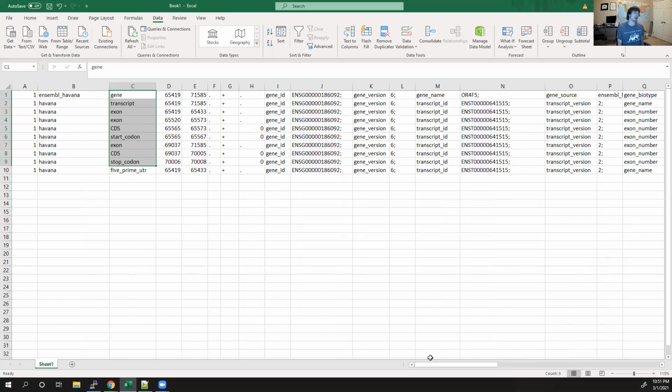on multiple lines. That can be irritating to look through because if we just try to grep out a gene ID, this gene ID is going to pop up for every single gene, transcript, CDS, start codon, stop codon, exon, 3' UTR, and 5' UTR. Way too much information. So it's not uncommon for me to simplify a GTF file and just pull out all of the lines that are protein coding and have the word gene in it, right? Because that's telling me where it starts, where it stops. I don't necessarily care about the exon intron boundaries. I don't care where the stop codon is. I just want to know where this gene can be found in a genome.